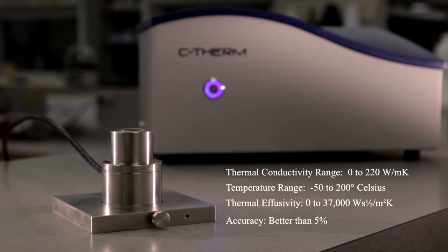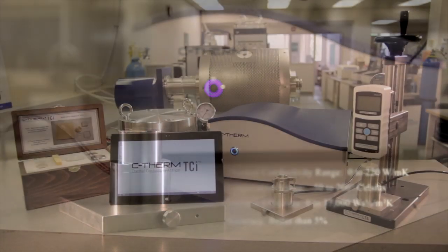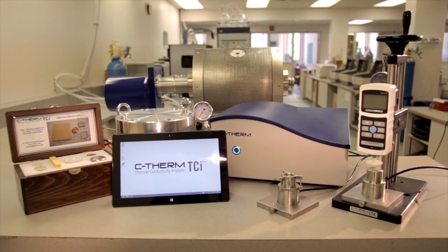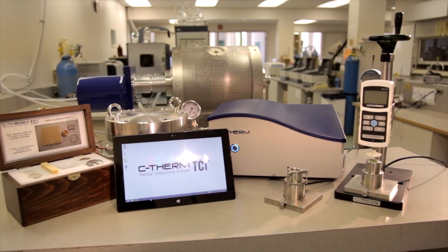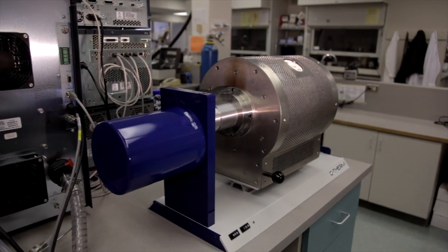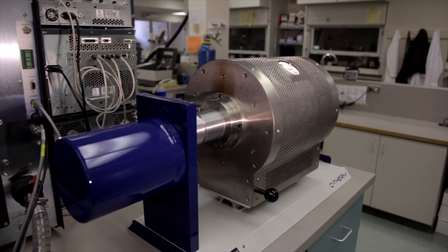Introducing an impressive line of new accessories for researchers in material characterization, including an option to pair it with C-THERM's new dilettometer series, originally developed with a consortium of industry users.